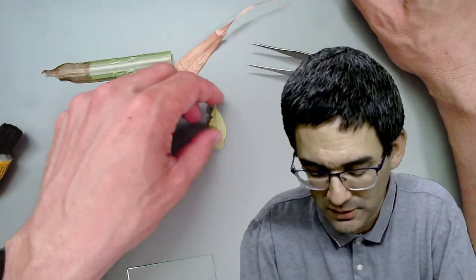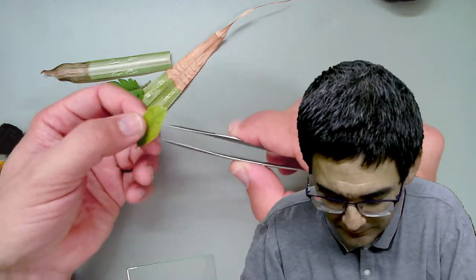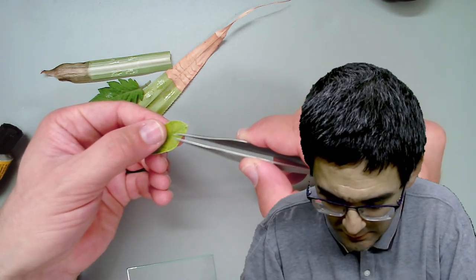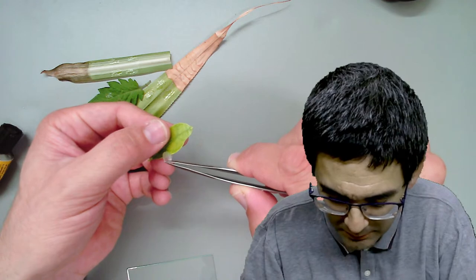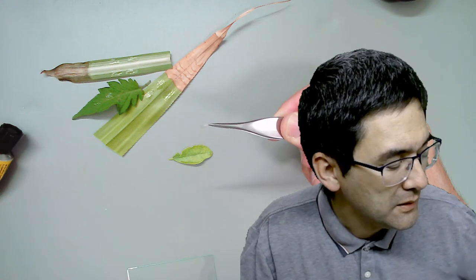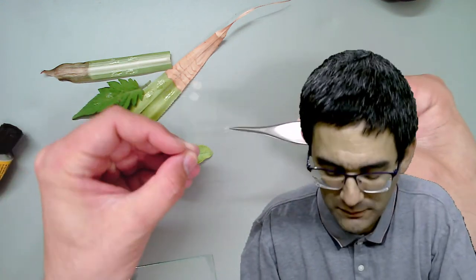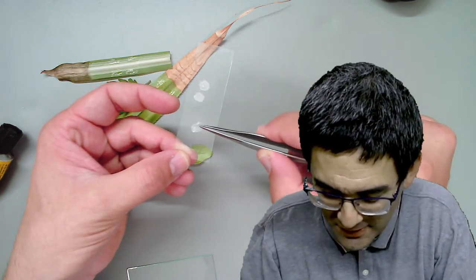Let's take the top surface of the same leaf - I applied the glue just before the start of this livestream. It comes off quite nicely, though you might have a difficult time seeing it because of the low contrast, so I'm going to take off the slide.